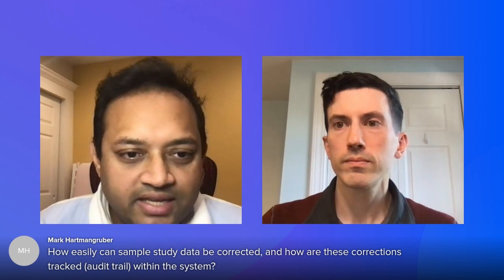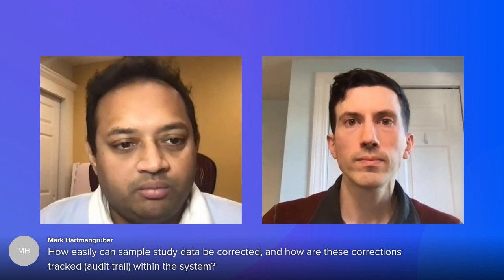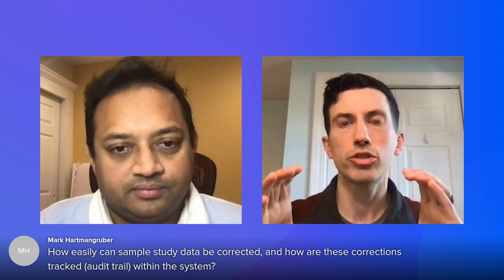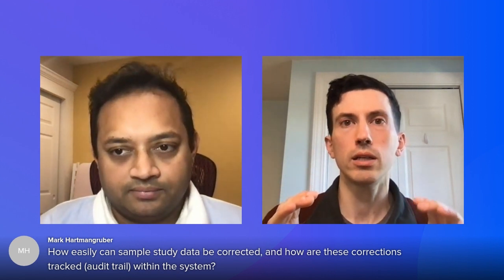It says, how easily can sample study data be corrected, and how are these corrections tracked, audit trail within the system? Tom, you want to take this? Yeah. So I had shown you a structured table early on where it captured some analytical data off of that ELISA.